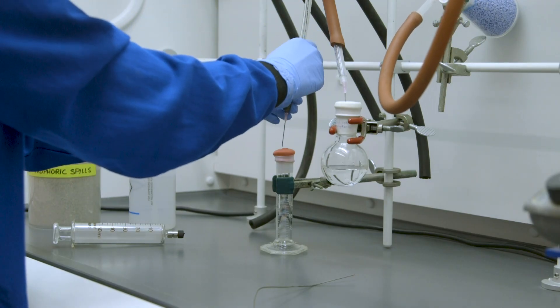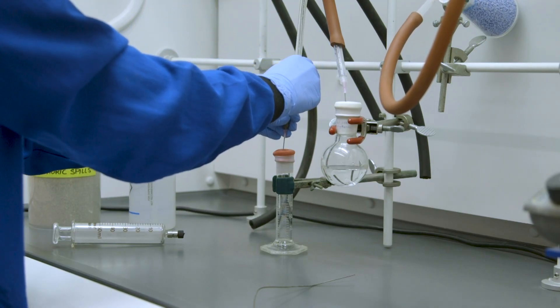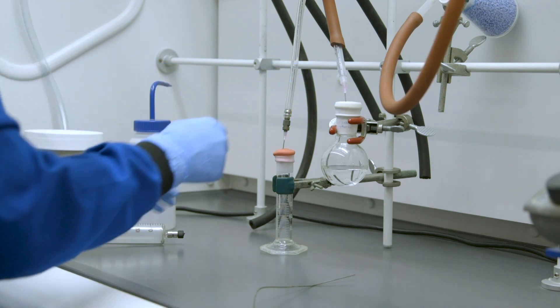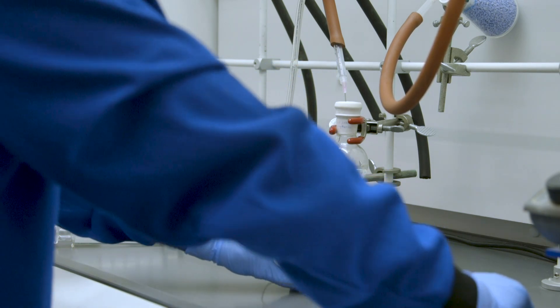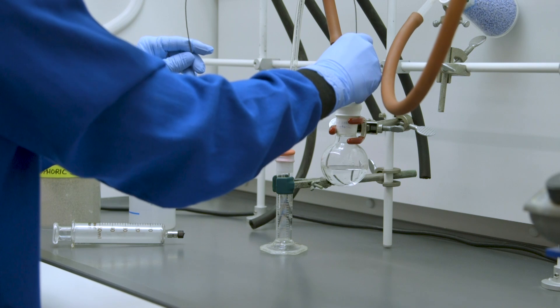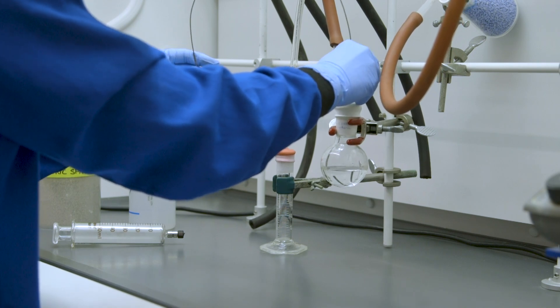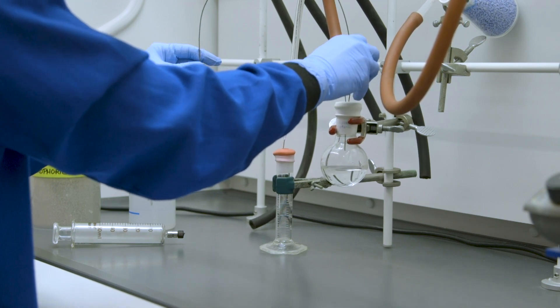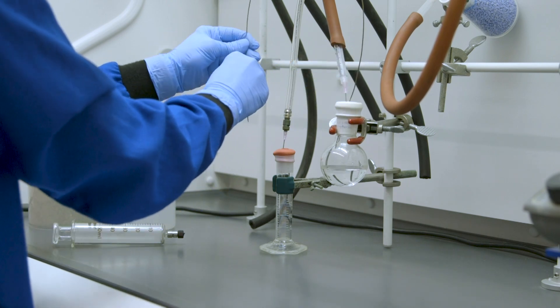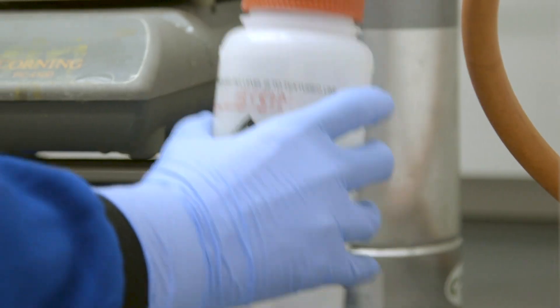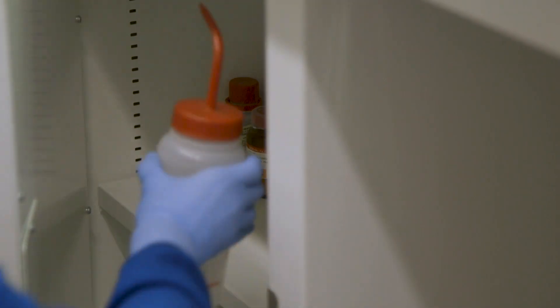The septum will later be pierced with a needle or cannula to transfer the pyrophoric liquid. The reaction solvent and other non-pyrophoric materials are added to the reaction apparatus. Any remaining openings are sealed with an appropriately sized septum or stopper. Any flammable materials not required for the reaction must be capped and removed from the fume hood.